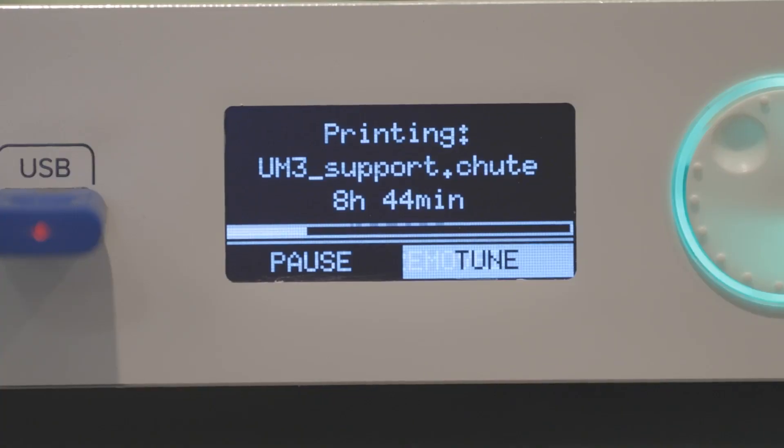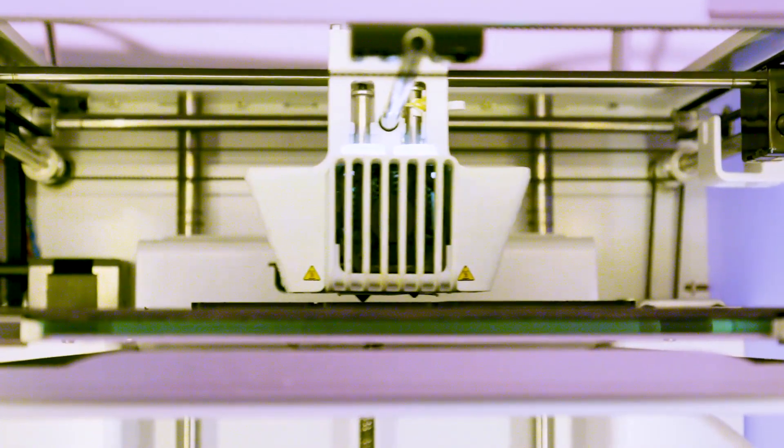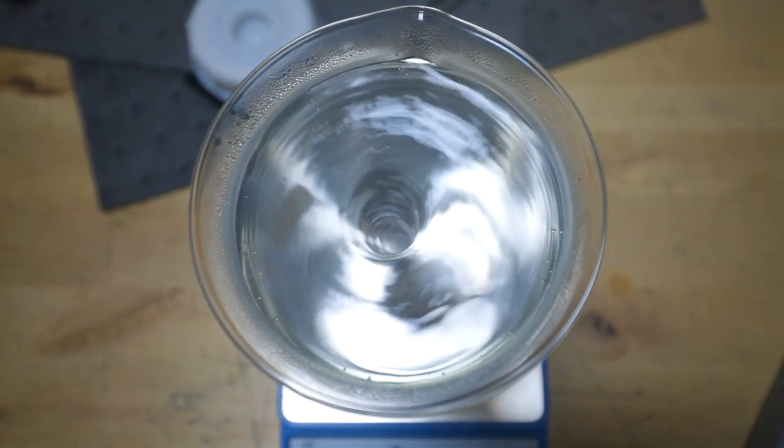There's a ton of rapid prototyping that happens at this place. We have multiple 3D printers that are running all the time. We still have that startup culture. We're hand assembling prototypes, testing them out, improving the design, iterating, and then even producing tens or hundreds of this instrument here in Rochester.